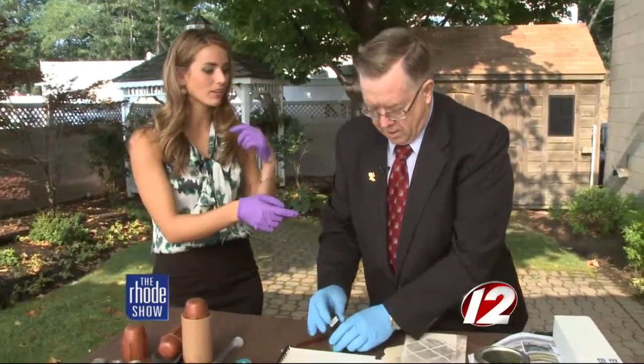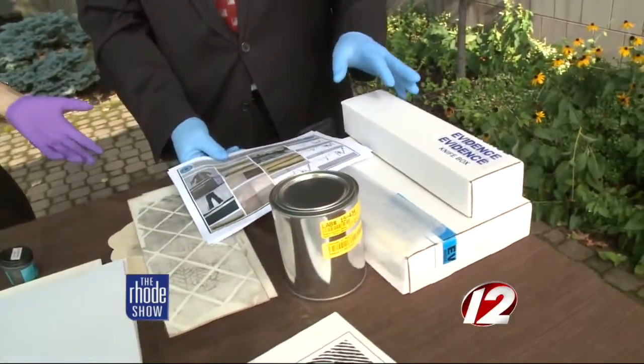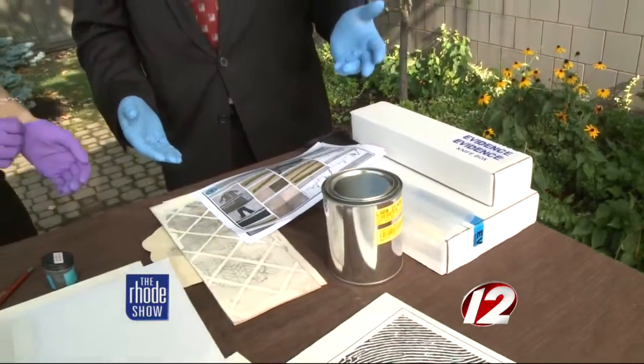Now, you've brought along some other things too that are very important when you are going into some sort of crime scene to determine the cause. One of the things we do is train police officers to do crime scene investigation — the CSI people — because we don't do CSI. So we have to train them how to collect and package evidence properly. If it's not packaged properly and it comes to the laboratory, it can be spoiled.